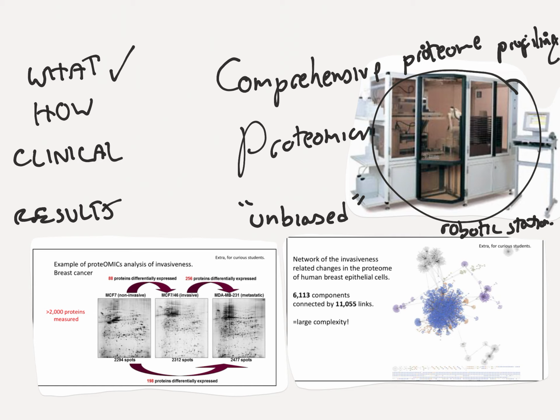The first one being separation, shown right here. I'll explain what that is in a minute. And the second one being analysis. There's also another picture that represents analysis, but I thought in our case, let's just focus on having one picture so you don't get confused. And finally, finding out how your results can be valuable on a clinical level. I'll just put a question mark to represent that.